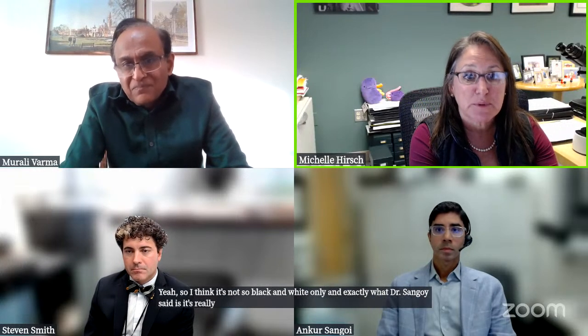Yeah, so I think it's not so black and white, and exactly what Dr. Sangoy said, it's really dependent on the subtype of the kidney tumor. So certainly chromophobe, we know, pushes on the capsule without invading it much, much more frequently. You can have very, very large 10, 12 centimeter chromophobes that don't necessarily invade. So if you did that kind of stratification, it would have to include subtype as well as size of the tumor. So I think that complicates it.